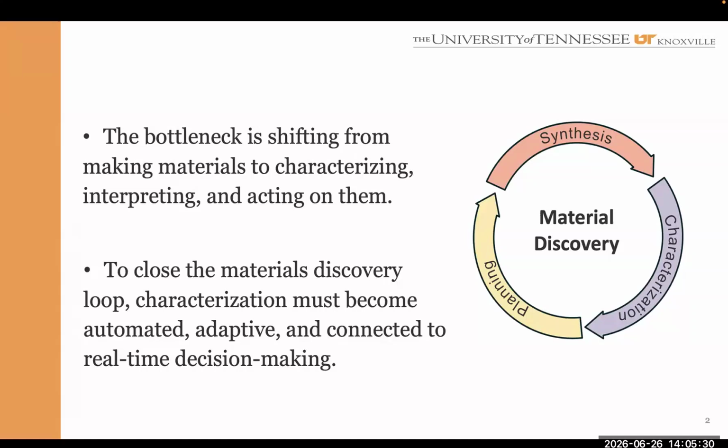So the obvious question, why do we need it? So why do we need this automated material discovery, automated synthesis, except for the fact that sitting in front of your laptop and running your transmission electron microscopy, scanning electron microscopy, scanning probe microscopy manually can be quite boring from time to time. So obviously, we would like to find the new materials or optimize materials we have much, much faster than we can do it today.